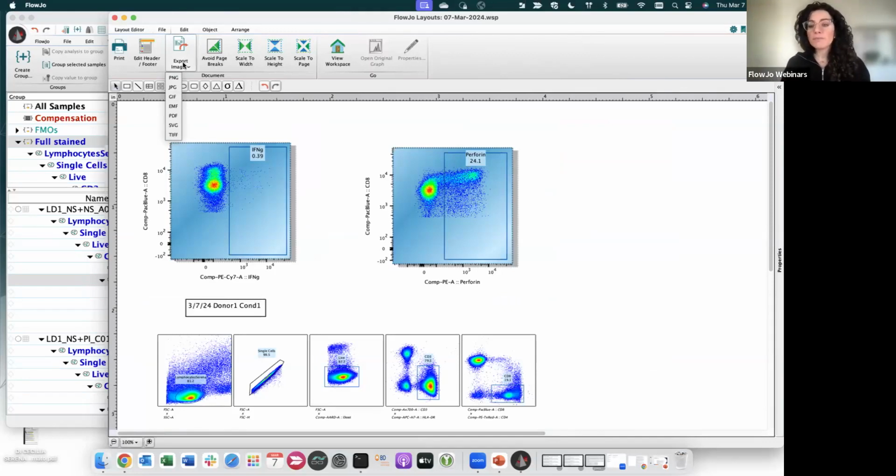But if you want to ungroup, let's say, whatever you have on your plots, I suggest you export it as an SVG and edit it in a vector software, which is not PowerPoint. Okay? I cannot make any claim for any other software, but PowerPoint is not a vector software that will allow you to ungroup things, okay? But in case you just need the document, you can save it as PNG, JPEG, PDF, TIFF, whatever, okay?